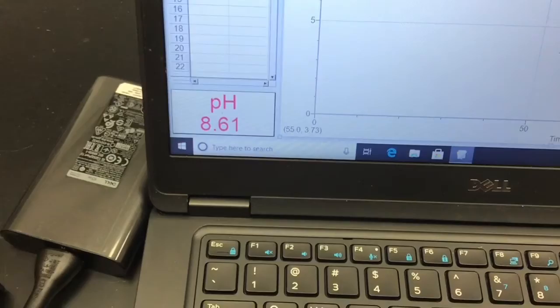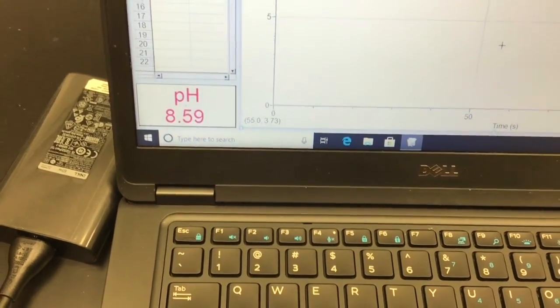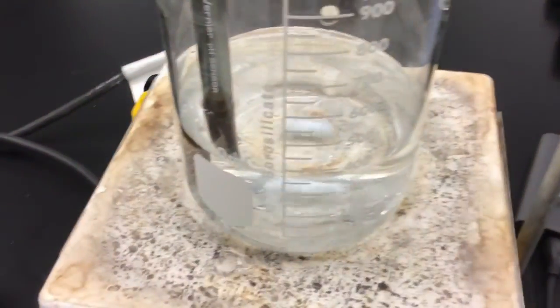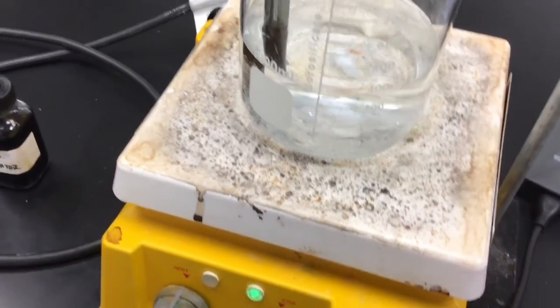My pH meter is reading about an 8.6 right now, but it is dropping. If I gave this enough time, I imagine it would get to about a pH of 7. There is another way to go about doing this, and that's to use an indicator. We are going to use an indicator today.